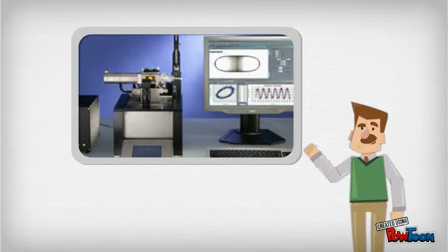This diagram shows the inside of the spinning drop tensiometer. The measurements are carried out in a rotating horizontal tube which contains a dense fluid. A drop of a less dense fluid, liquid, or a gas bubble is placed inside the fluid. The rotation of the horizontal tube creates a centrifugal force towards the tube walls.